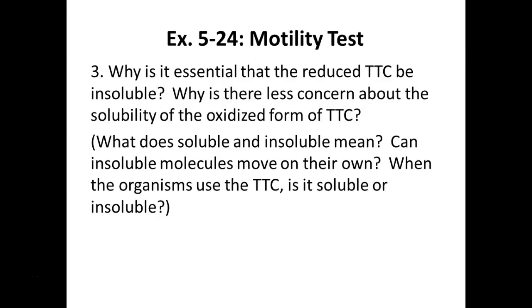It's going to stay right where it is. And that's important, because if we turned it red and it was still soluble, it would go everywhere, even where the bacteria aren't. We need it right next to the bacteria because we're using it to show us where the growth is.